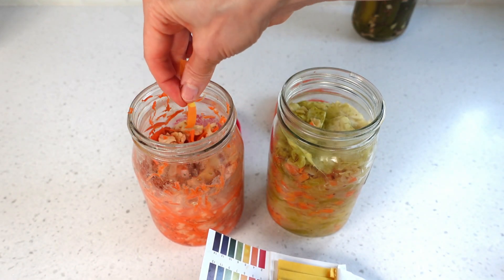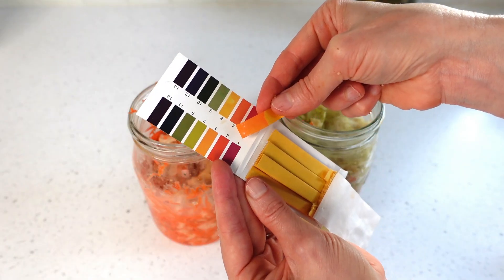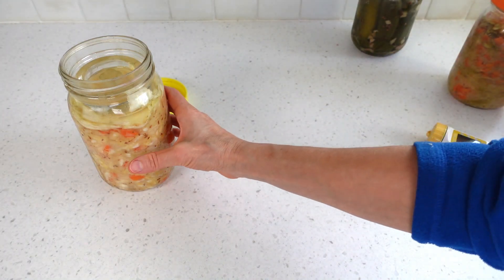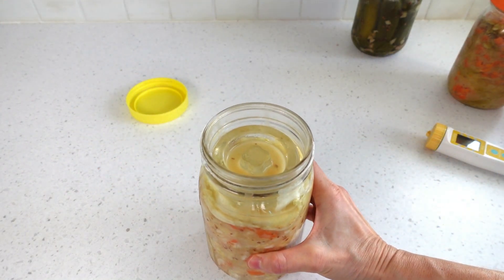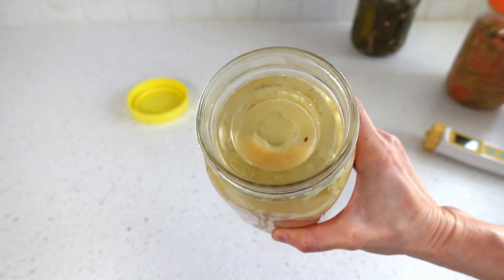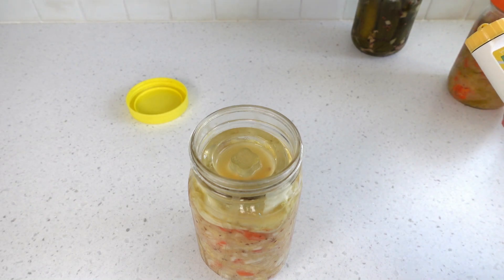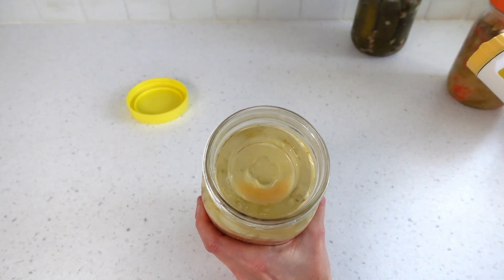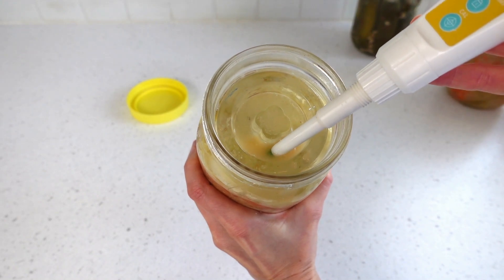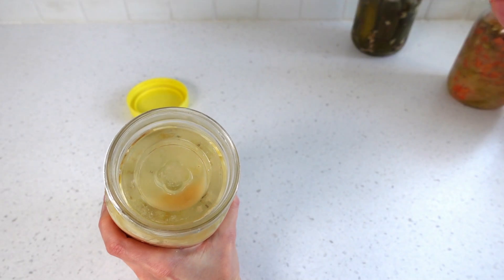Testing the carrot and cauliflower fermentation the same way — this one has a little more liquid, so a better reading can be taken, which makes it easier to compare to the color code chart. This looks to best match the pH 4 color. For the sauerkraut with an in-between brine level, with the weight still in the jar and just a shallow bit of brine, the upgrade pH meter can nab a reading, and the paper strip would also not have a problem. To use the basic meter in this situation, the weight would need to be taken out first for there to be enough brine to adequately submerge it.